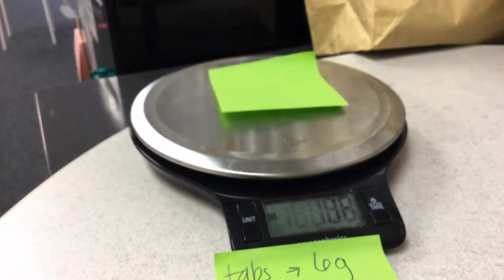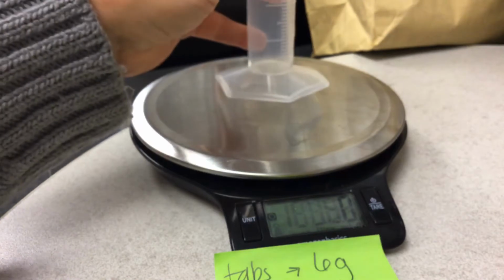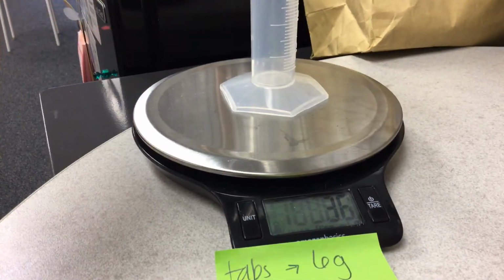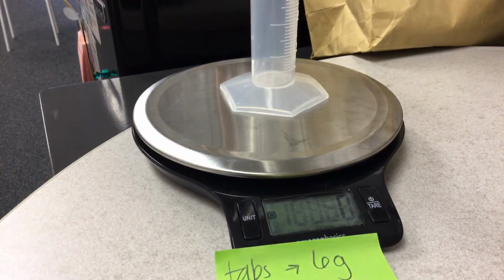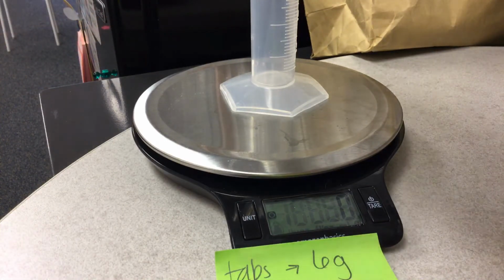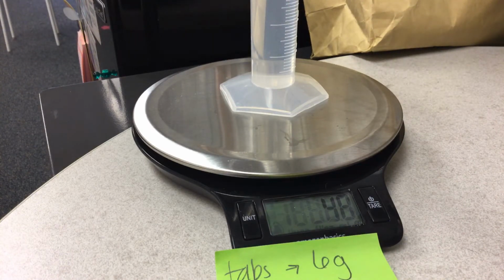Alrighty, so I'm going to go ahead and take this off. And now what I'm going to do is I am going to measure what my water is. But remember, I don't want to know what the weight of my graduated cylinder is. I want to know the weight of the water. So I'm going to go ahead and zero this out so that it's not acknowledging the weight of that. And you don't need to necessarily see how much liquid I have in here. That's okay. We are going to go ahead and just fill it up with some water. There we go. And we're going to look at that, and it actually says that it is 48 grams.